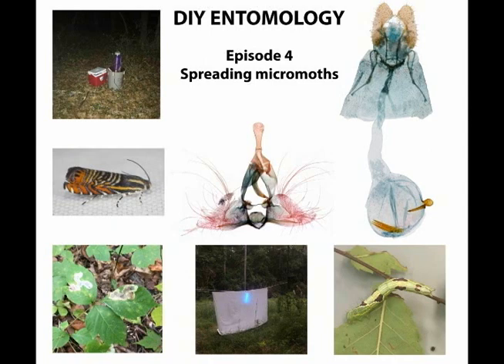Spreading micro moths can be daunting, but with a little practice anyone can do it. In this video I'll demonstrate my techniques to relatch and spread micro moths.